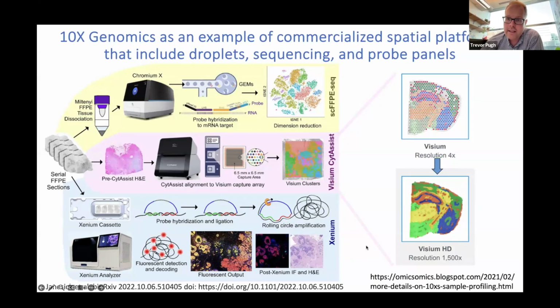And really, there's no right answer. It's really about what is your scientific question? Do you need true single cell information? Is the local neighborhood average sufficient? Or maybe you don't need spatial information at all, and droplet-based methods are totally fine.